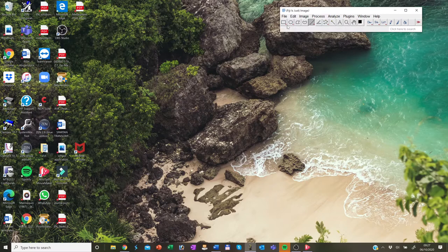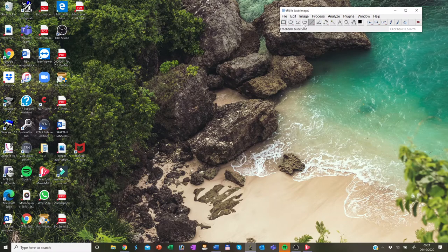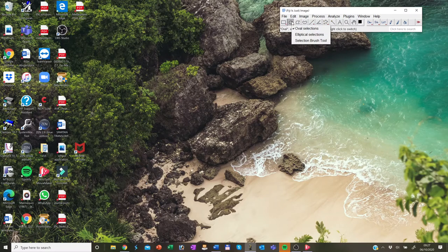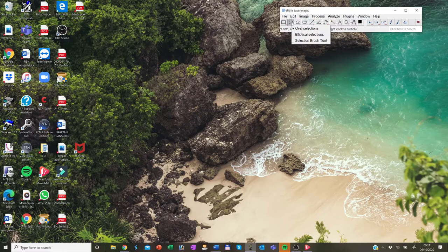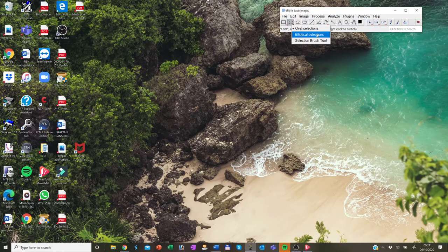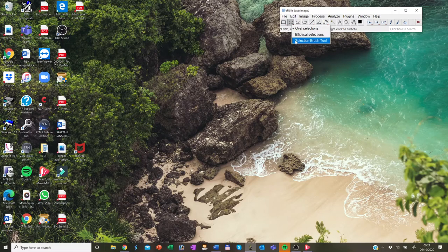If there is a small red arrow in the lower right corner of the tool icon, you can right click. And then you can select alternative selection tools. For example, here, you can choose oval selection, elliptical selection, we can go to brush tools.